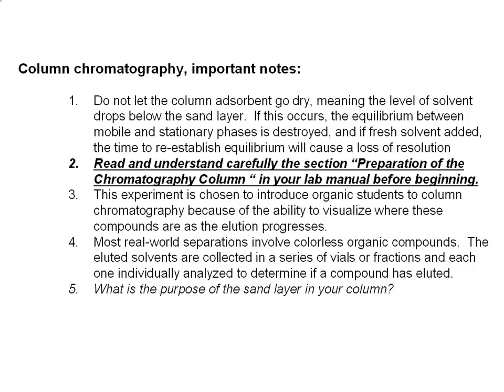So before you do your column, where you actually separate and isolate ferrocene and acetylferrocene, you have to keep several things in mind. First of all, don't ever let your column go dry. Don't allow any part of your column to go dry.